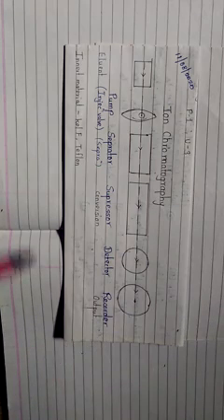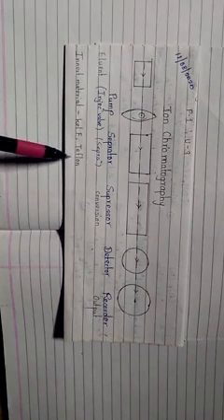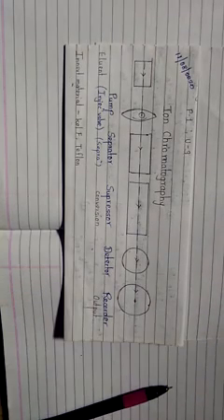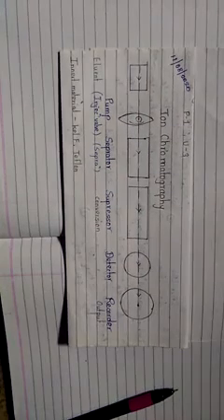What I said for construction of the column, the inert material which is used: here you can see the KEL-F, Teflon, also polypropylene, and the last one is recorder. Here whatever signal is there is fed to the recorder. From that we can measure the concentration of ion.